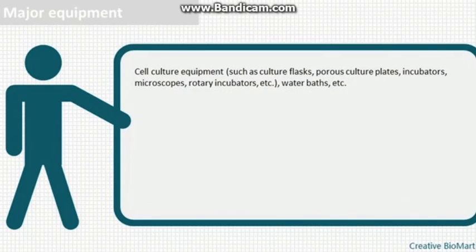Major equipment. Cell culture equipment such as culture flasks, porous culture plates, incubators, microscopes, rotary incubators, etc., water baths, etc.